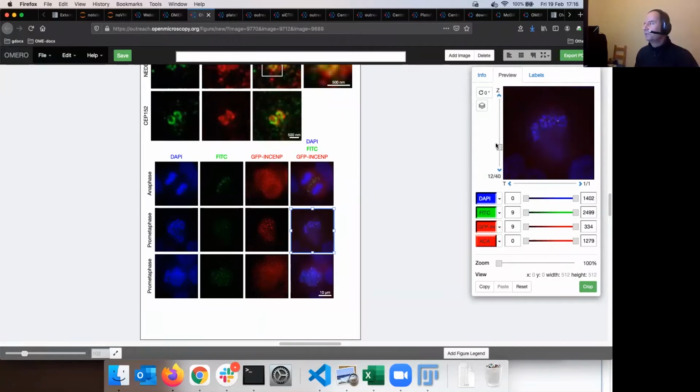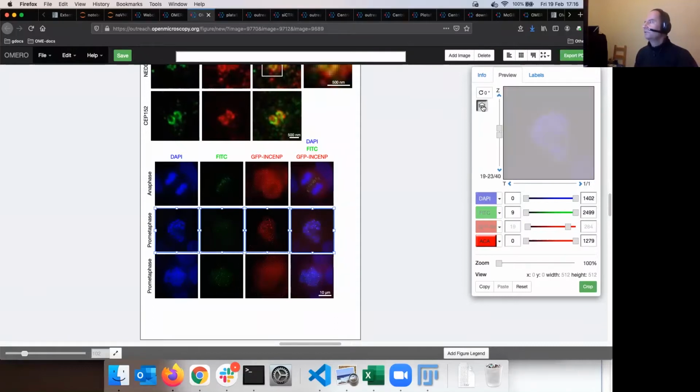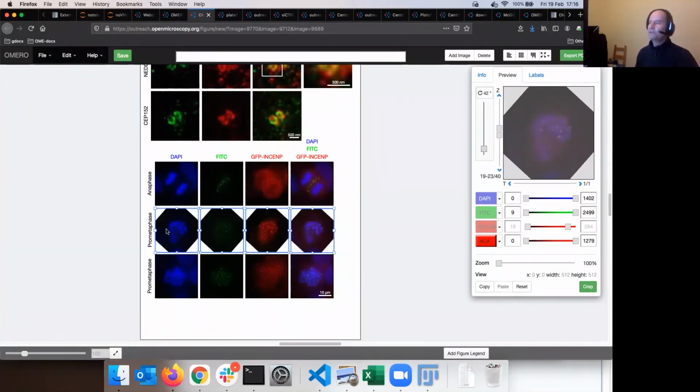Whereas OMERO figure is basically giving you the advantage of everything being on the fly and connected to OMERO, and this means that you can at every moment correct your mistake very quickly, so that I can, for example, even now do projection on that image or indeed on the same row, like so, etc., etc. There is also a provision to rotate the image if I wish so.